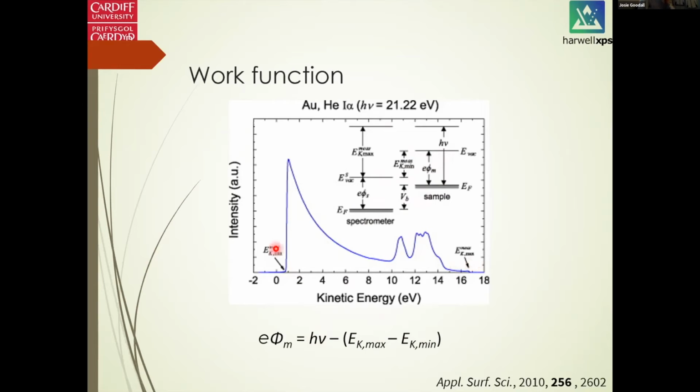In terms of how to do it in the spectrum, we can use the secondary electron cutoff here and the maximum kinetic energy here.